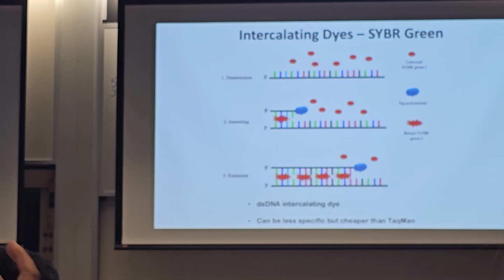So imagine we're doing PCR, we've denatured our two strands of template, and now we're doing a PCR amplification with a primer. So this represents our primer, it's annealed to our template. This is our polymerase here, and it's tracking along the DNA and copying. The little red blobs here represent SYBR. They should be green blobs because SYBR Green, right? But they're red in this picture.